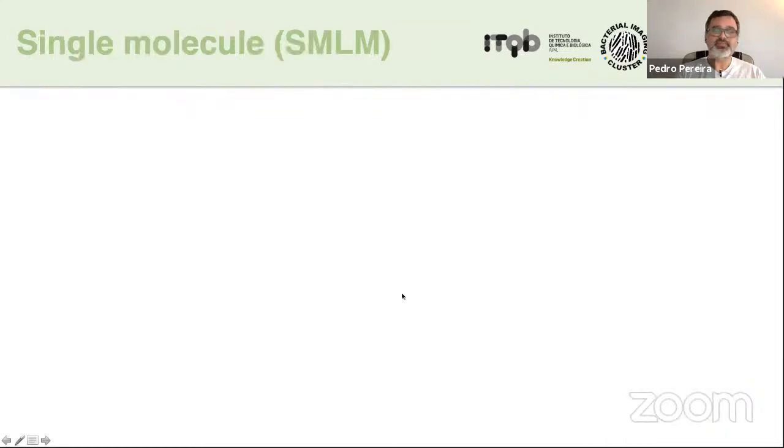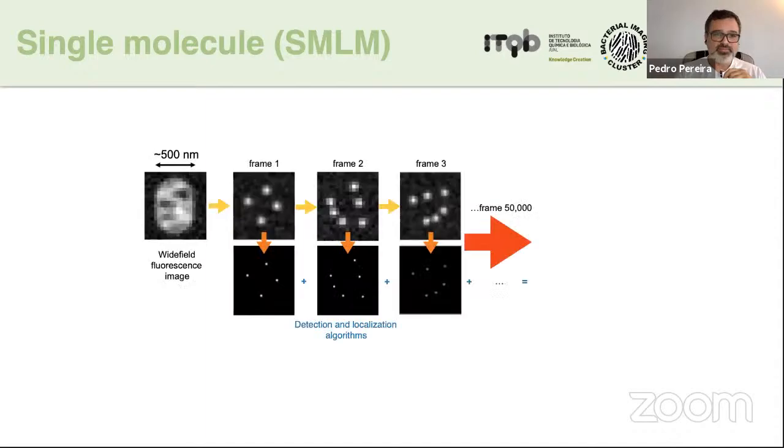Okay, so now let me tell you a bit about single molecule. Single molecule is probably the oldest and the most well-established super resolution technique available. Also because the systems, the microscopes themselves are cheap and easy to build and easy to use. How does this work? So as the name suggests, you need single molecules, right?